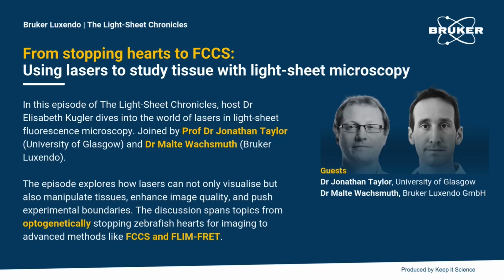Take these reference images and use this as a calibration image that you can then use to correct your actual image from an actual sample post-acquisition. This helps a lot with the intensity, but not so much with the beam width or the thickness of the beam at different areas across the field of view. And these are things one can address, for example, with calibrated imaging using methods like fluorescence correlation spectroscopy. If you have some time later in the course of our discussion here, maybe we can discuss this as well.